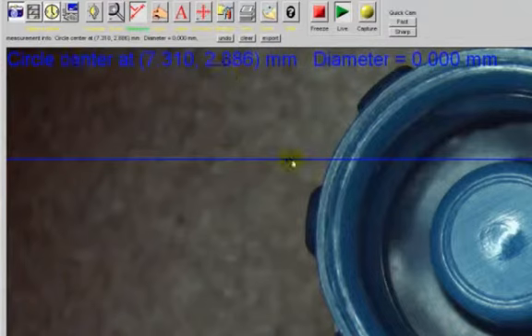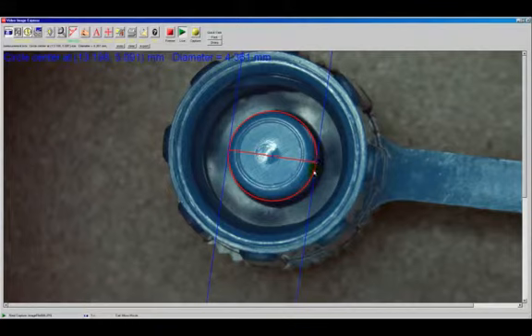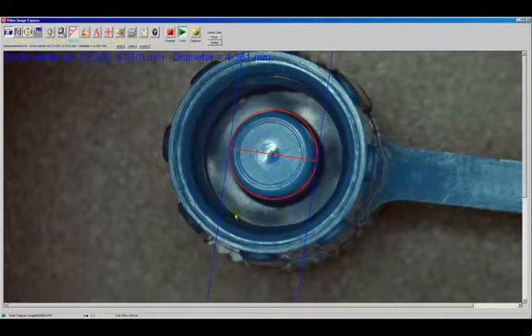It's a larger font. The outer lines are now blue, and the inner line is red. So that's very useful if you want to set a go, no-go type scenario on your image, because you are working with the live image, that you can have this tool have certain colors associated with it. So you can move that by grabbing it in the middle and placing it where you want, and your outer lines are blue, your inner lines are red.